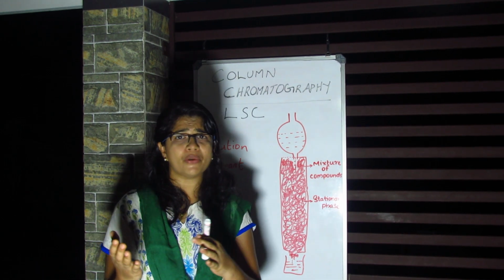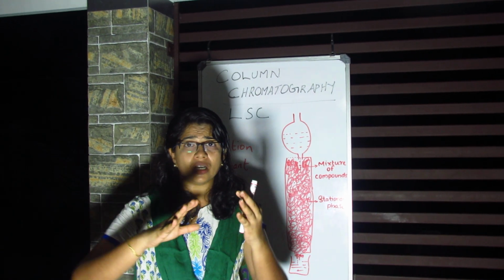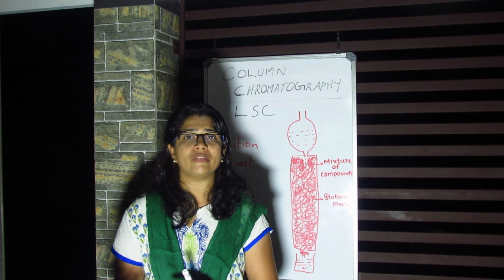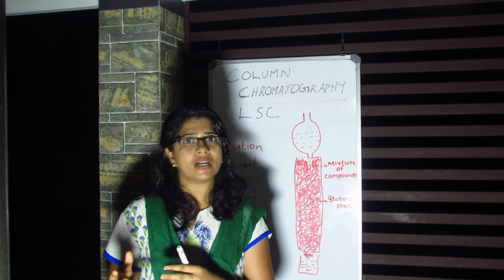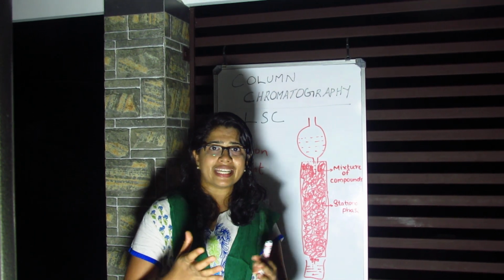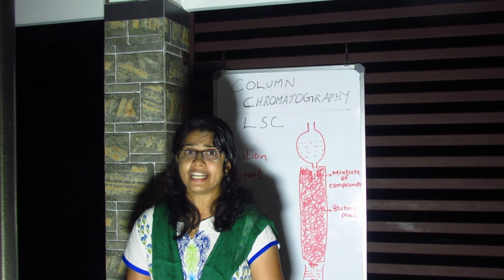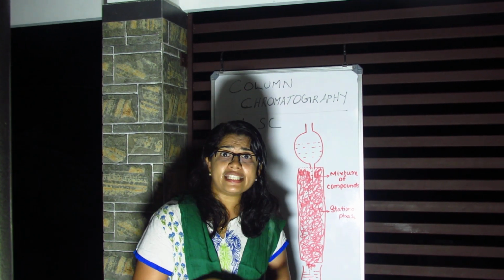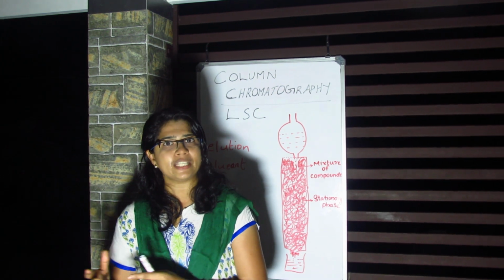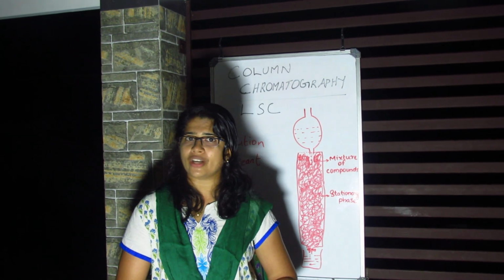The component which is strongly adsorbed can be eluted very slowly, and the weakly adsorbed components are eluted very rapidly. So the different components get separated at different rates. Finally, by distillation or evaporation of solvent from these fractions, you will get the pure component.